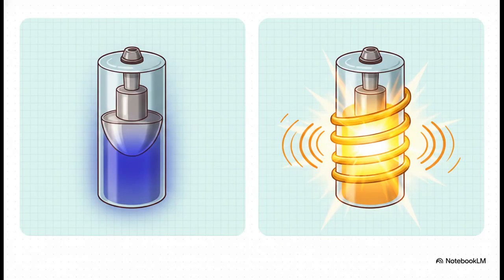But some elements are just stubborn. They're much harder to excite. That's exactly where the electrodeless discharge lamp, or EDL, steps in. Instead of a standard cathode, it uses radio frequencies to excite the atoms, which pumps out much stronger emission intensities. It's a lifesaver when you're dealing with tricky elements requiring higher radiation intensity to get a solid signal.